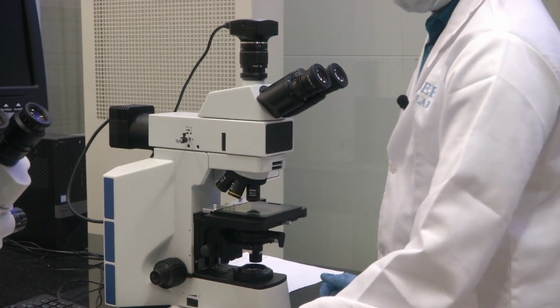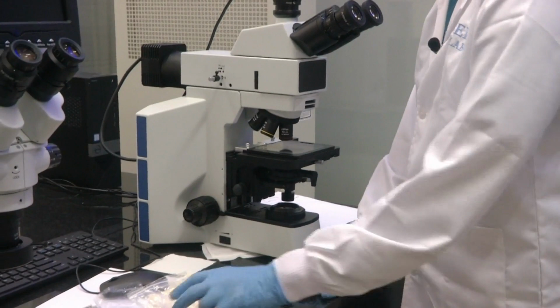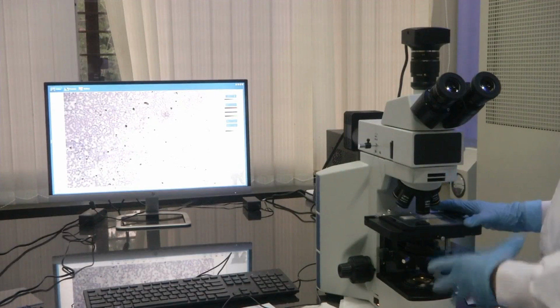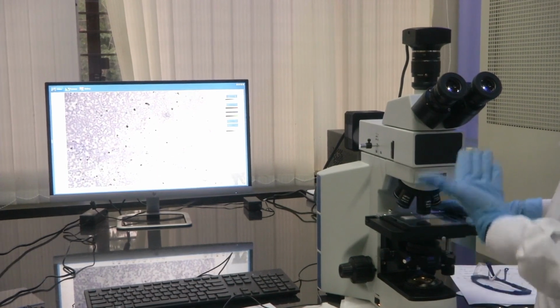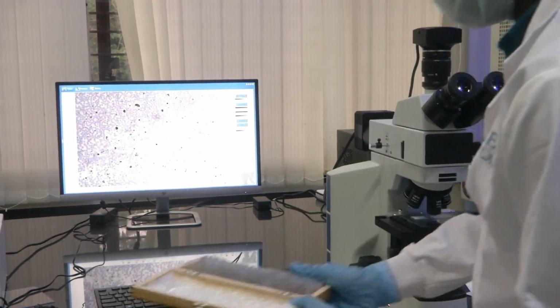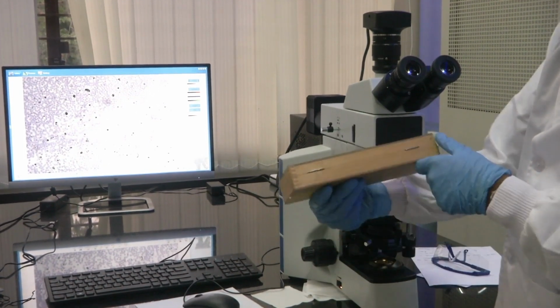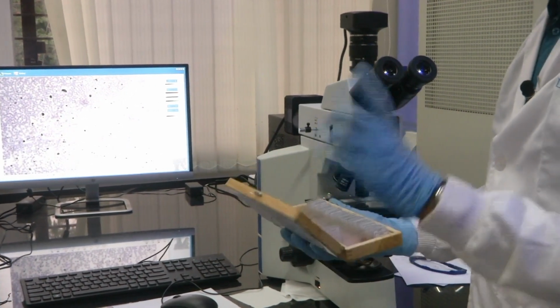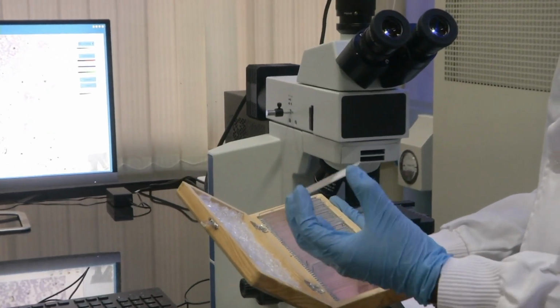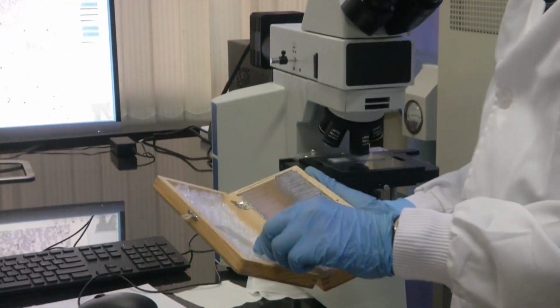Now, we will look at one or two samples, and see how bottom illumination captures images, how top illumination captures images, etc. We will see a particular sample and how we see the image through the microscope. There is a box of samples that is readily available for purchase, and it has representative samples of different cell types. These slides are all inactivated, nothing to worry about. They are used for us to study, purely for academic purposes.